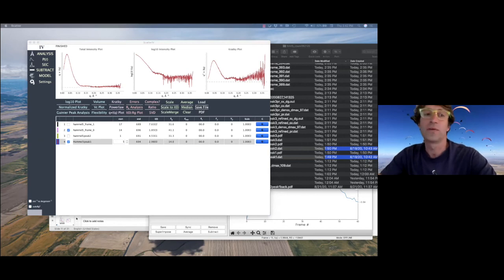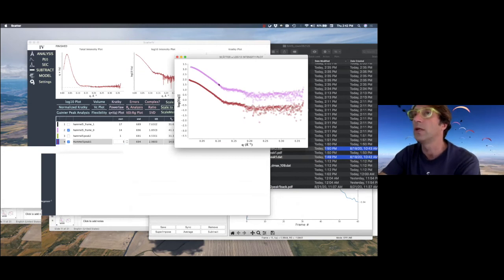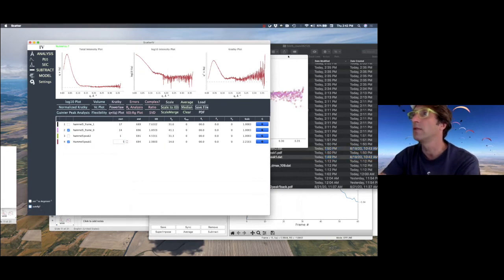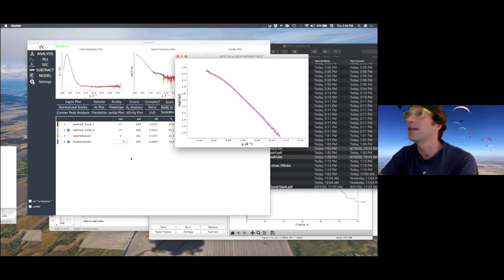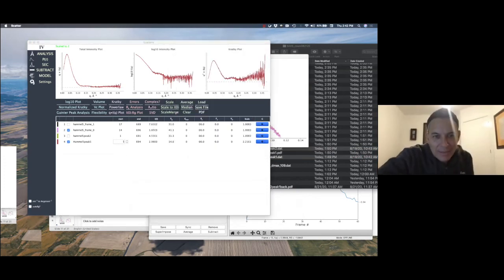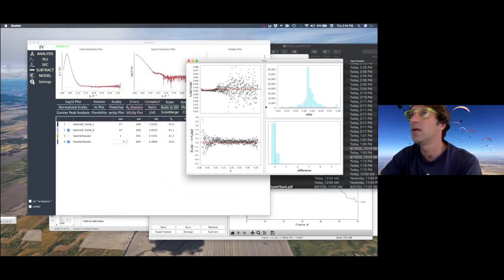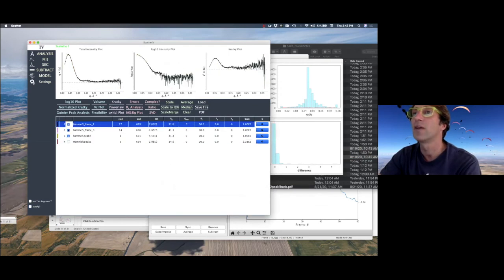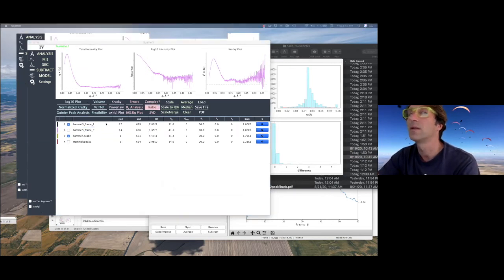Okay. So when we compare those scattering profiles from SVD, what is the pink one versus the red one? We need to scale those. Hit the ratio button. It's right there, right above the SVD button. It's pretty similar for peak 1. That surprised me, because when I did it last time it was absolutely not similar; it changed a little bit. Scale and plot peak 2.